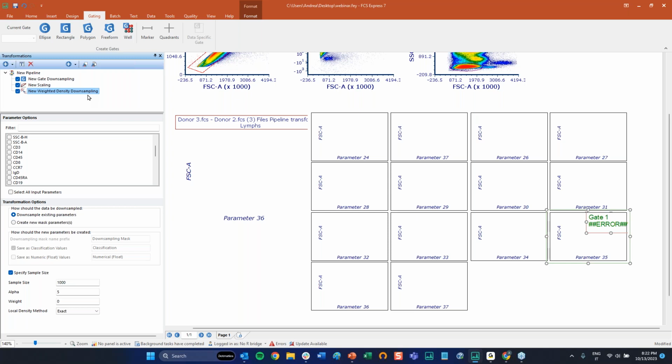If you have very few neighbors around you, you're probably a very rare data point. Okay, you have few neighbors around you, so you are in a sparse region, you're probably a rare population. So this is why this type of downsampling must calculate the density, okay, to basically classify data points in dense and data points in sparse regions.